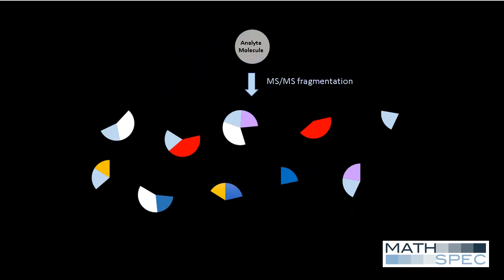Unlike NMR and IR spectra, where individual substructures of a molecule can be characterized by their frequency, the masses of individual fragment ions in a mass spectrum are not usually characteristic of specific substructures. Each fragment ion mass must be interpreted in the context of other fragment ion masses in the spectrum. To do this, the mass spec approach is to use partitioning.